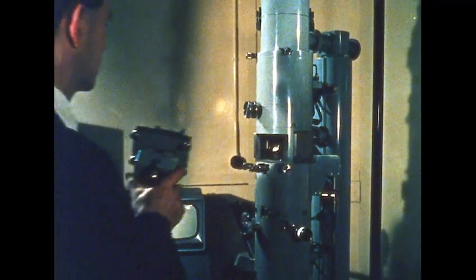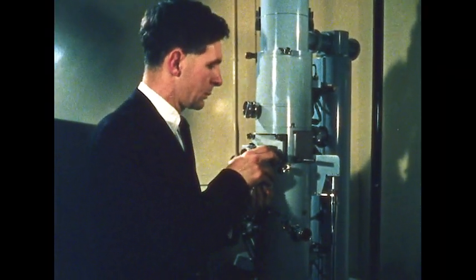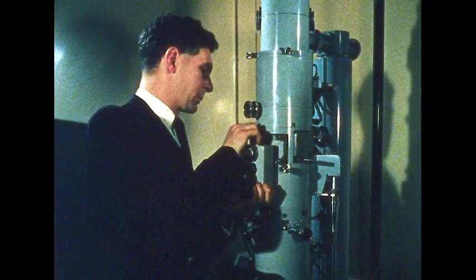as they happen. Here, the brass pin on the left is set at an angle to the electron beam, casting a shadow to the right. Magnification is 10,000 times. On the normal viewing screen, the picture is hardly visible. But with the image intensifier, one can see pieces of the pin breaking off and welding themselves to the plate.